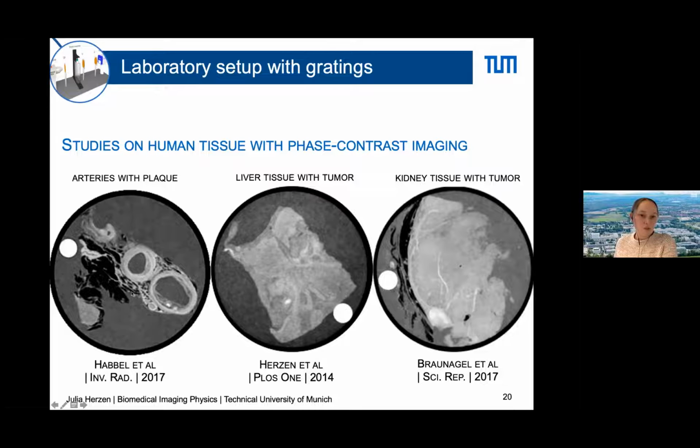This is a Falcon tube with a large amount of tissue, which gives you significant statistics for a huge tissue. But the resolution is still not enough, so we are not coming to the cellular level. We just see the structural changes, but we do not see the individual cells, of course not at 100 microns, and some features are also lost.